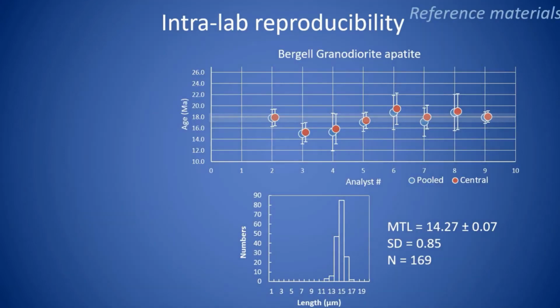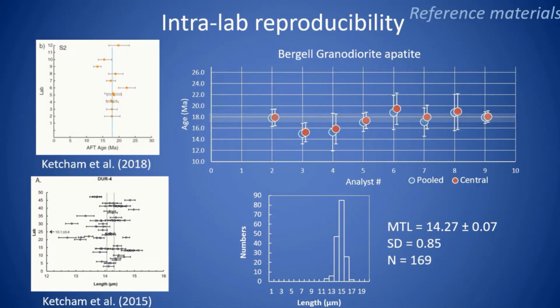All the samples provided have been used for intra-laboratory training at Melbourne over the past 6 years and have been measured by multiple trainees, showing pretty good reproducibility. Images of 2 samples used in previous inter-laboratory studies are part of the exercise for data quality evaluation. Through working on these 2 samples, trainees can compare their results with other labs participating in those previous studies. Again, we include many unsuitable grains in the image collections for grain selection purposes.